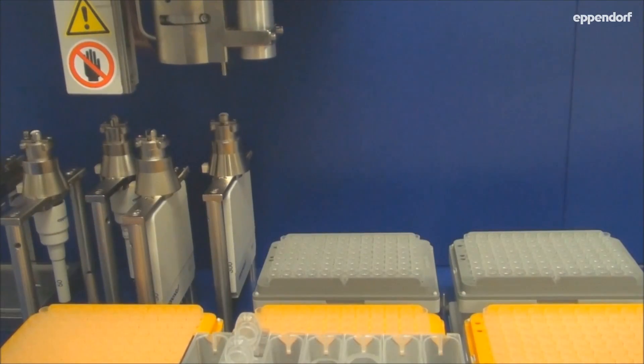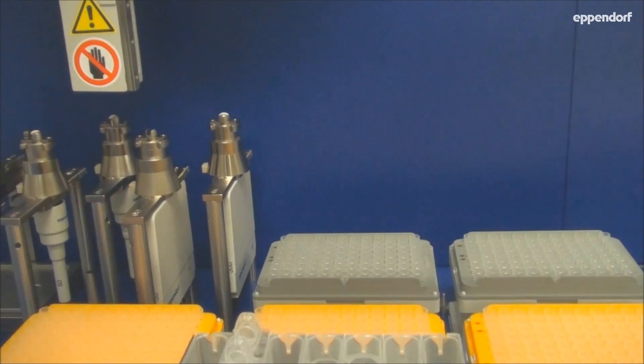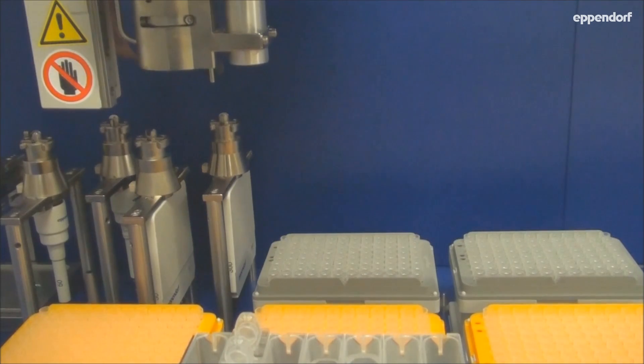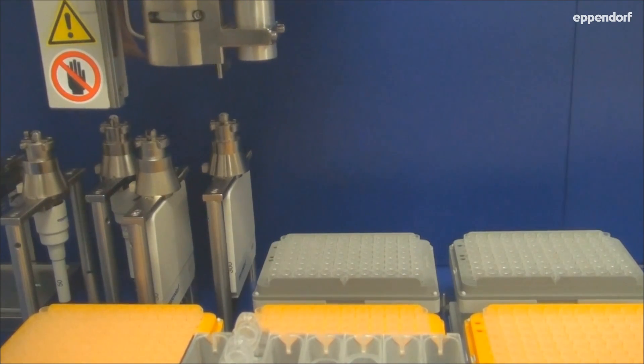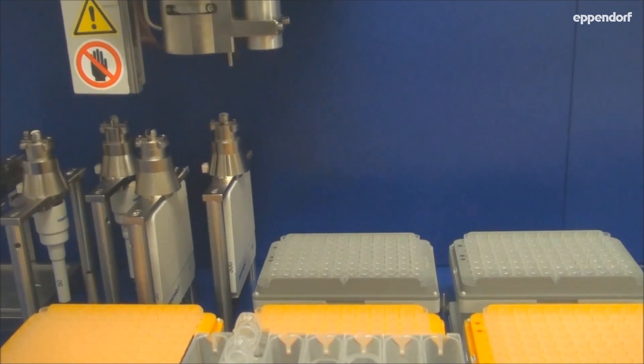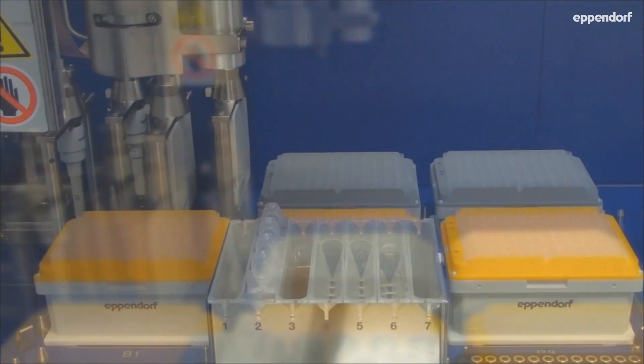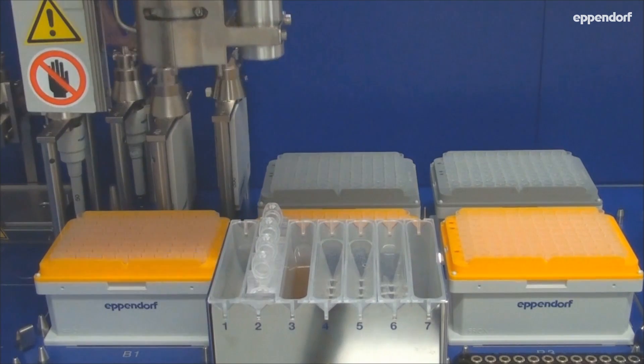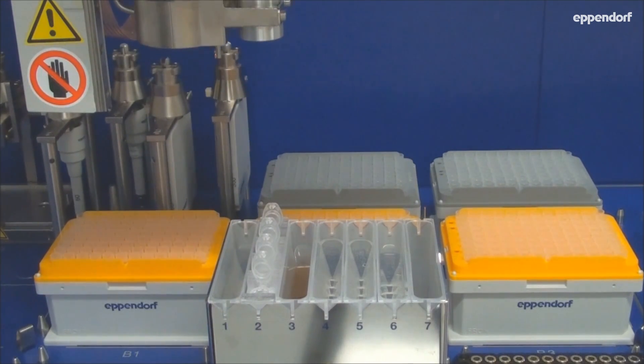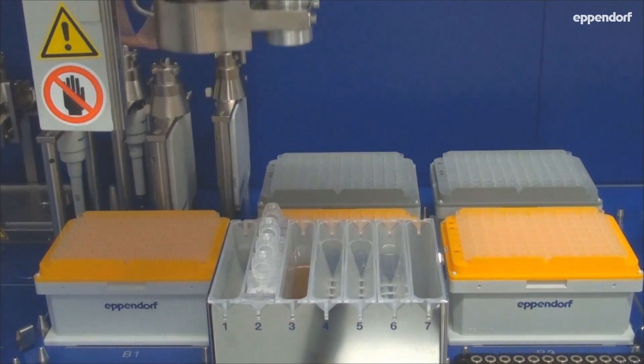The EPMotion 5075 TMX from Eppendorf has made the otherwise tedious sample preparation for next generation sequencing quick and painless. Manual setup can take as much as three days depending on sample number. However, the EPMotion can process 96 samples in a day, so your samples are ready to sequence the following day.